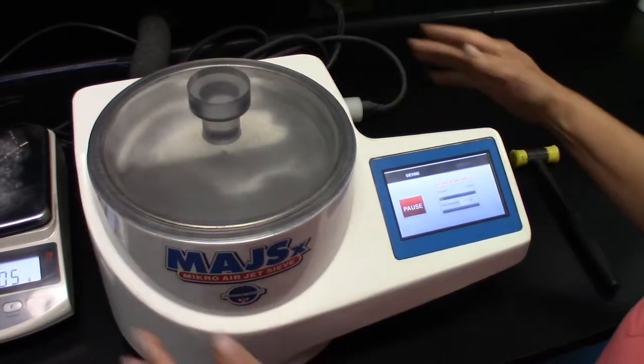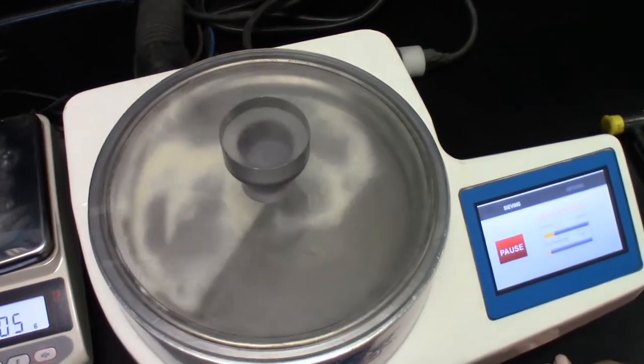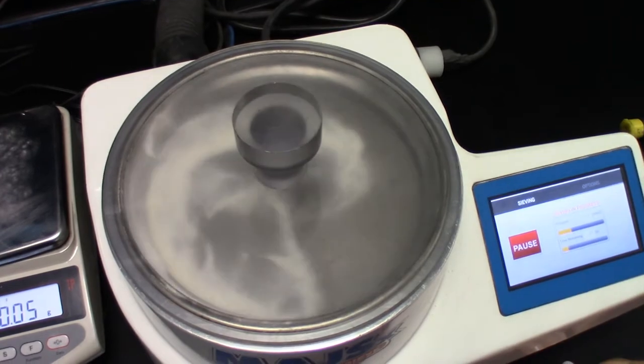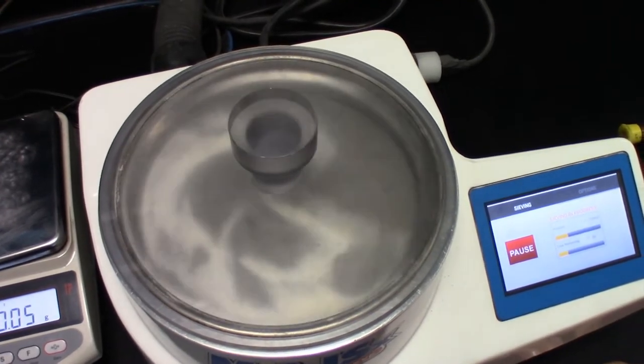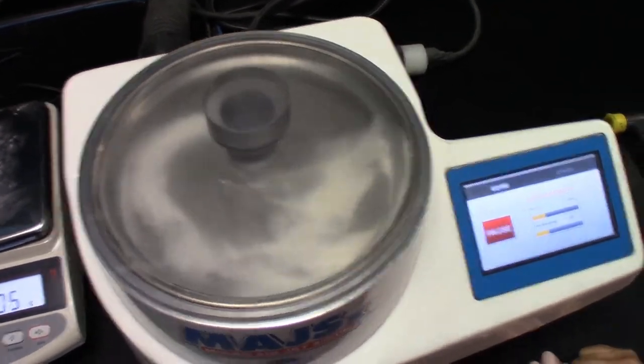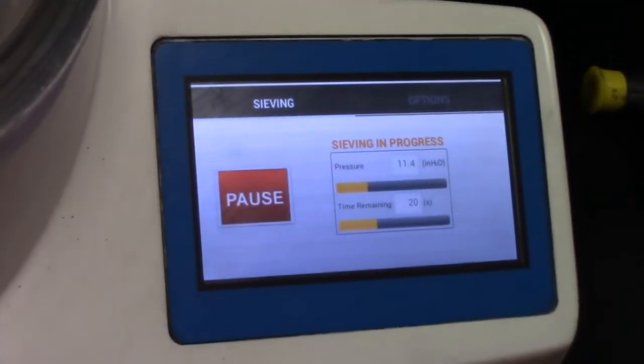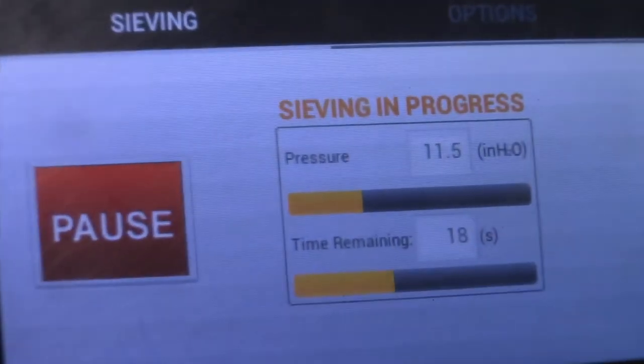With the basic version of the JetSiv, there are two parameters: the sieving time and the vacuum pressure. Vacuum pressure can be between 8 and 16 inches of water. I've got it set at 12.